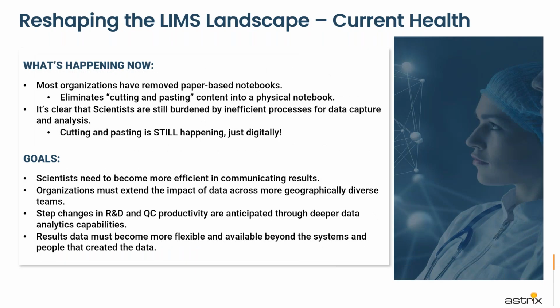So what is really happening now, and what is the current health of the overall LIMS landscape? Most organizations have finally moved away from the paper-based notebook. That's been very clear, which eliminates the need for physically cutting and pasting information into a notebook. However, scientists are still burdened by inefficient processes for data capture and analysis. Interestingly, cutting and pasting is still happening, just in a digital way.